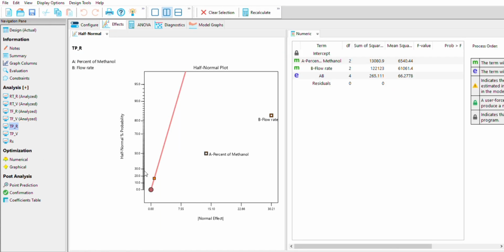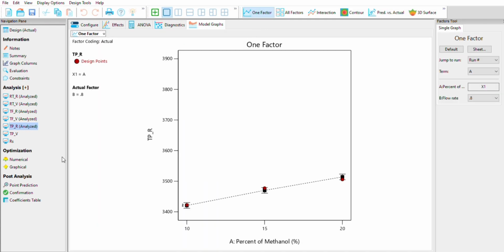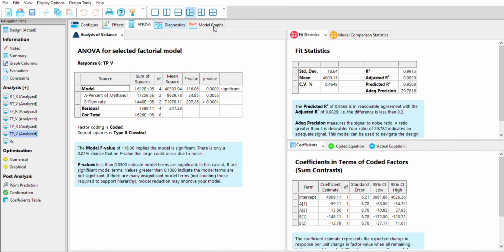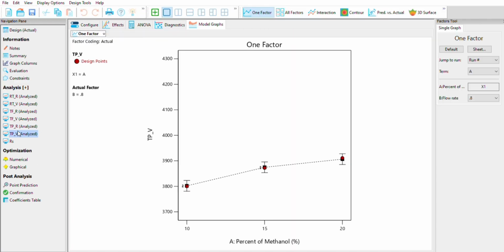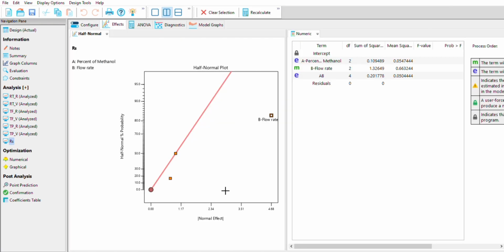Okay, here you can see I have just undergone the analysis. Whatever you have analyzed has already been clicked, okay, by analyzed. So this means I haven't yet analyzed the resolution. Just click on that stat analysis, then just click on your A and B. Okay, then click on ANOVA.